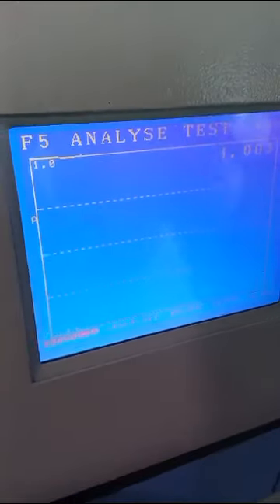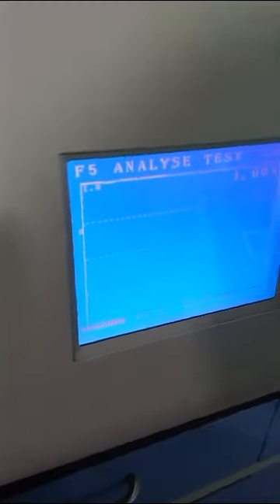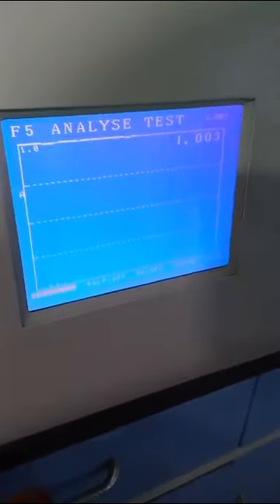Now you can see that if you compare the previous absorbance values that we got, as the concentration of our sample is increasing, the absorbance is also increasing. Which shows that we are actually on the very right path, like we are doing the right thing.